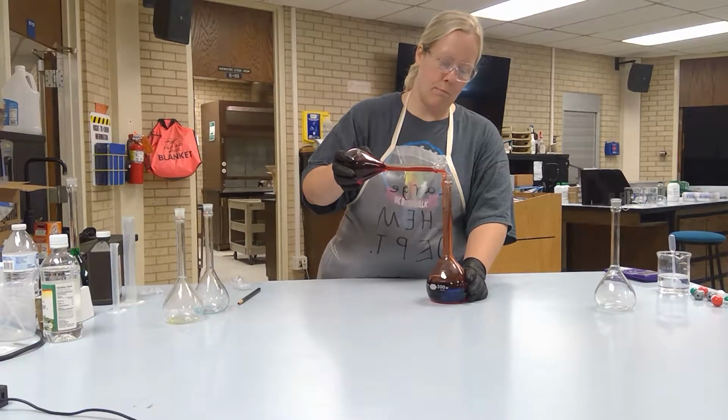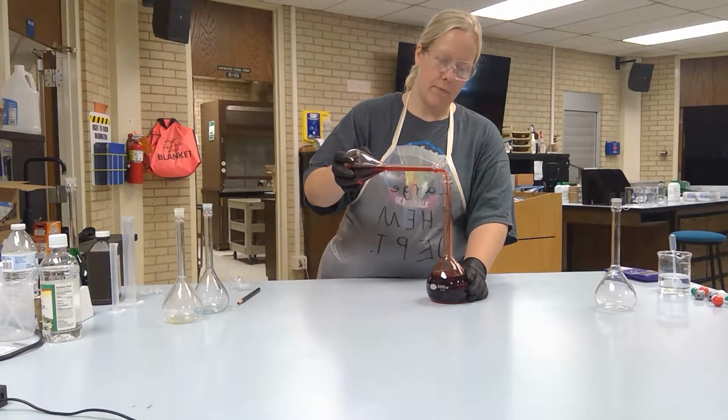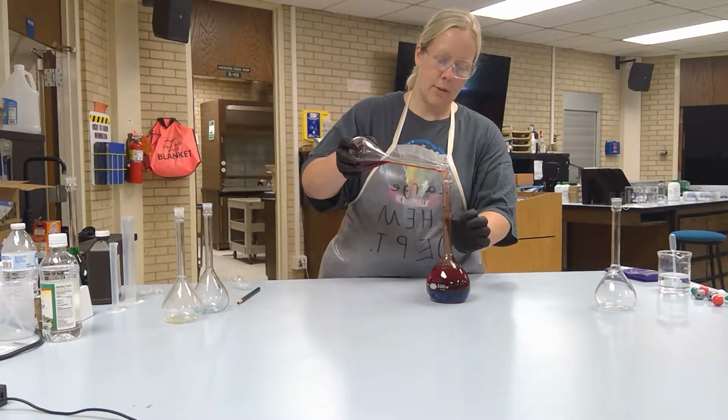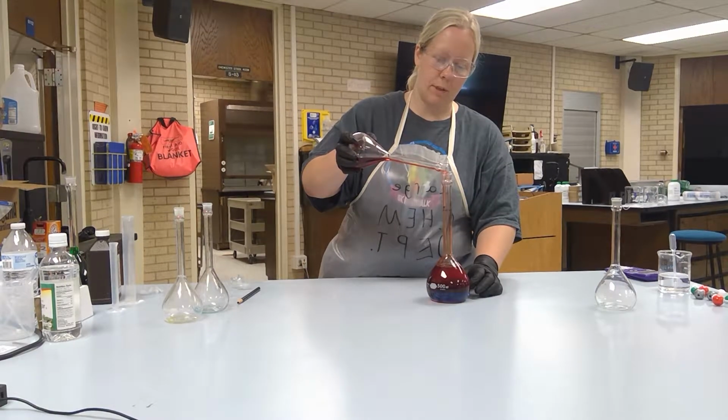Now if I mix red and blue together, I would hope that I get purple, but it seems to be a little bit more reddish in color. And if you look closely at the screen, you can see that there's this black pencil mark. That's my 500 milliliter line.